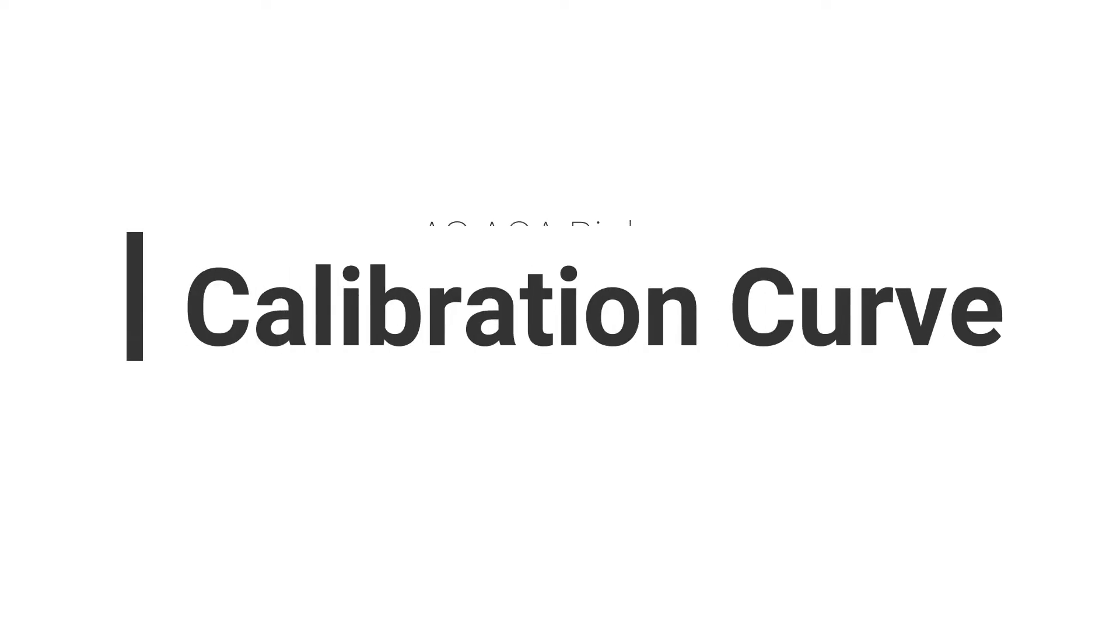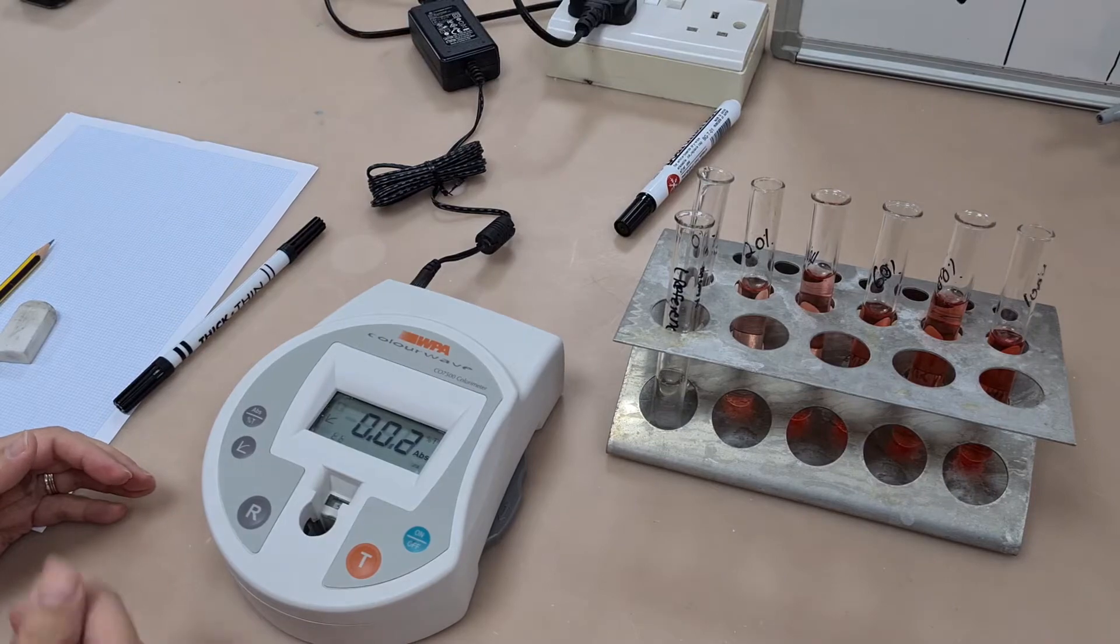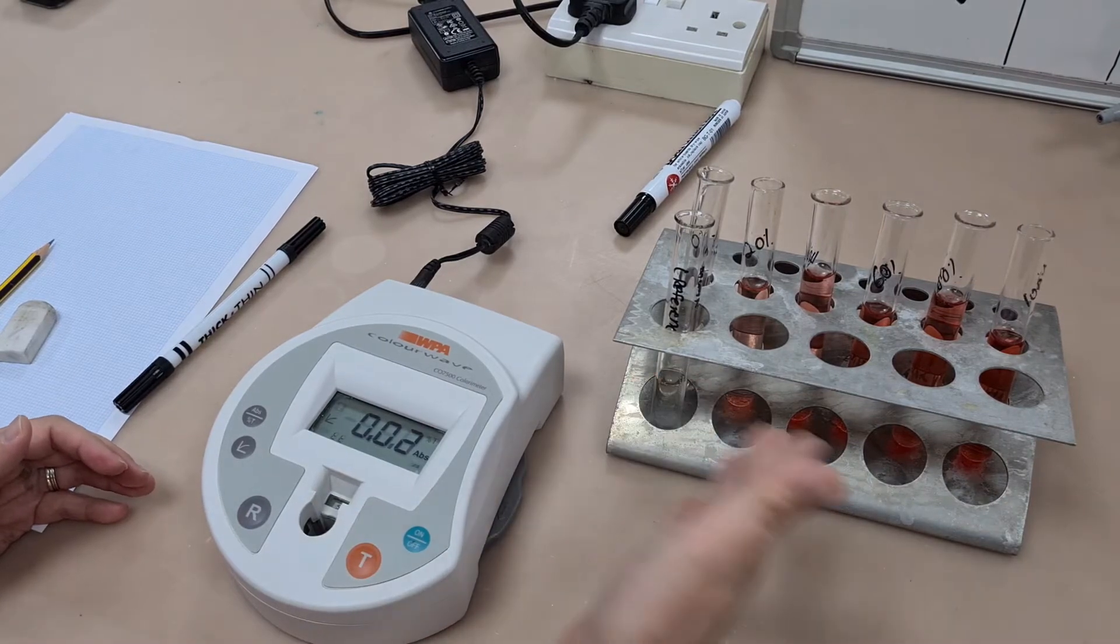In this video we'll look at how to use a colorimeter to make a calibration curve. We're starting at the point where you've already made your dilution series of your vegetable extract.